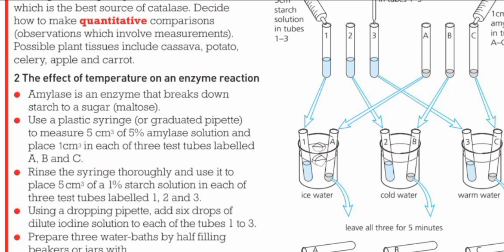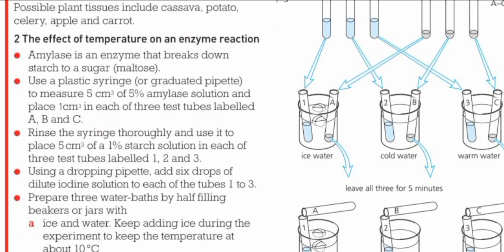Amylase breaks starch into sugar, that is maltose. Amylase is an enzyme that breaks down starch to sugar. The sugar is maltose.